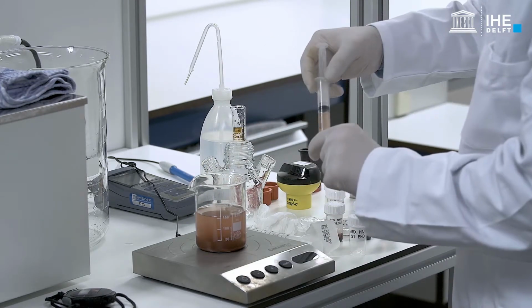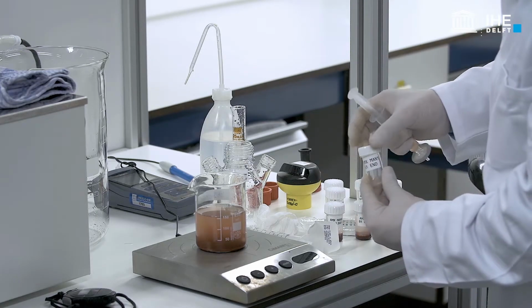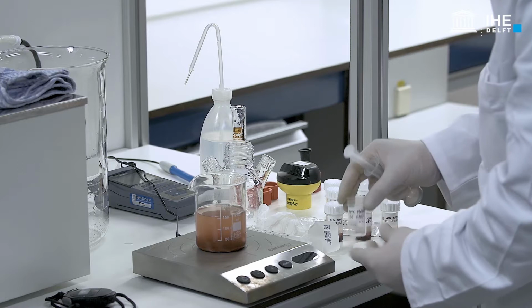Finally, at the end of the test, take a filtered sample for the determination of the ammonium, nitrite and nitrate concentrations.